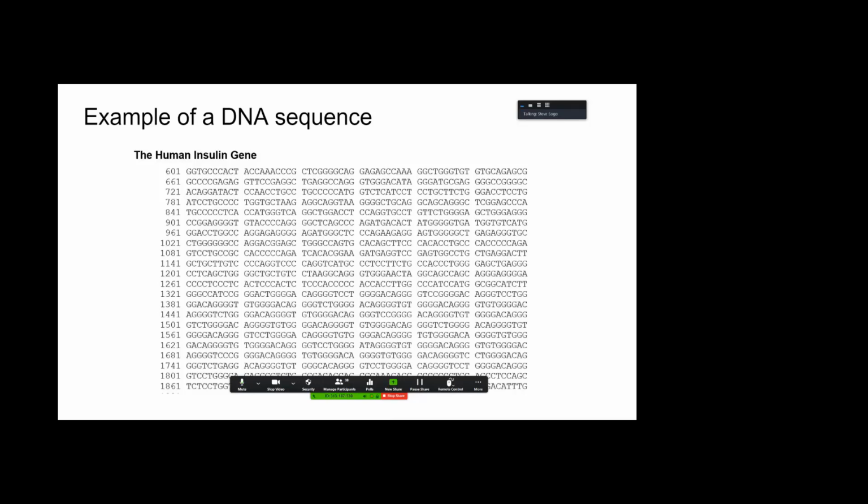And the tests for the virus need to find some sequence that will only appear in the virus, not in the 2 billion bases of the human genome. So it's finding a needle in a haystack, so to speak. So that's the challenge of the test. Find the virus gene.